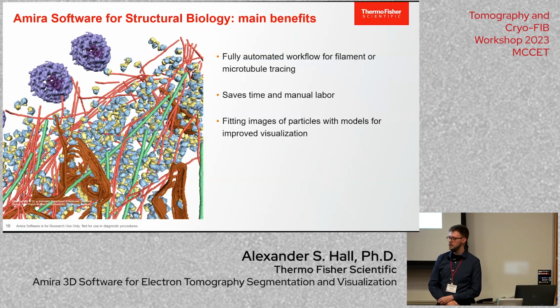So I would say it's somewhere in between an academic target and a commercial target, to build up a repository of ground truth segmentation to develop robust models that can apply in many user data cases.